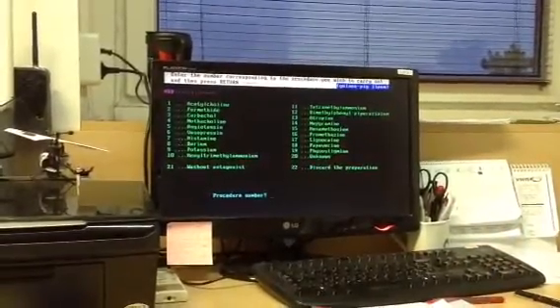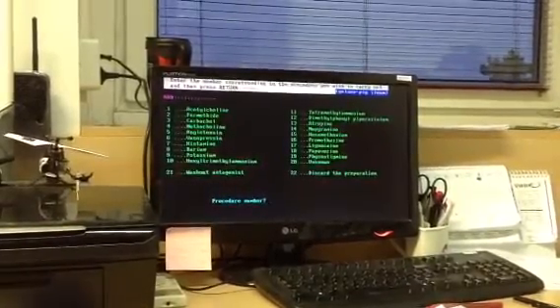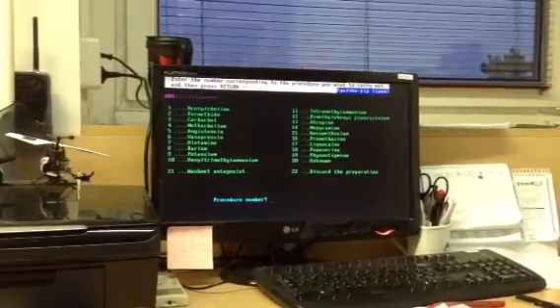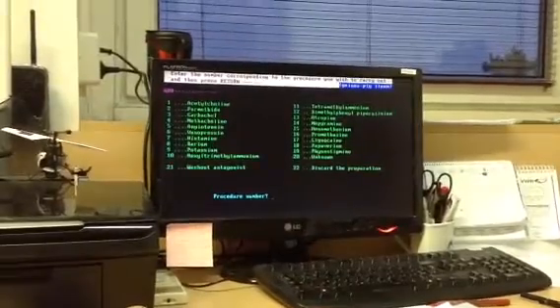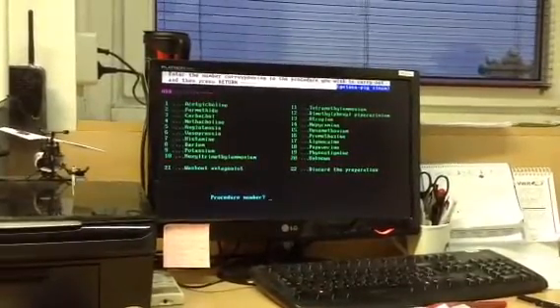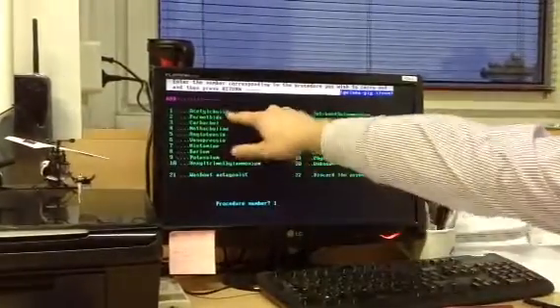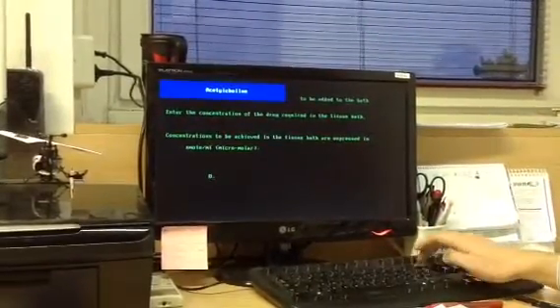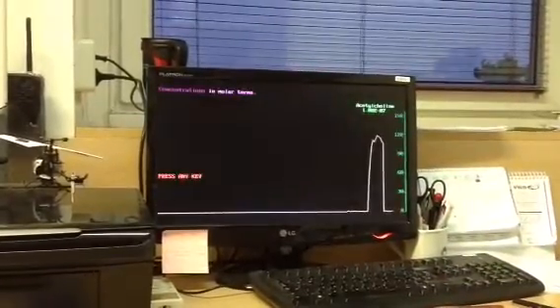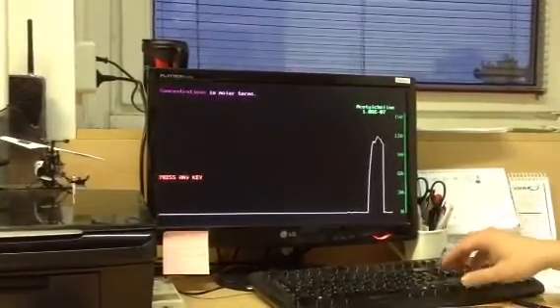What you have to show is acetylcholine's action. You can use different concentrations, but I think it's enough to show it with one concentration. And 0.1 micromole is what you have to remember. I'll tell you why. At first I will use the acetylcholine, so I have to press 1. The concentration is 0.1. You can see that the effect of acetylcholine is quite huge.